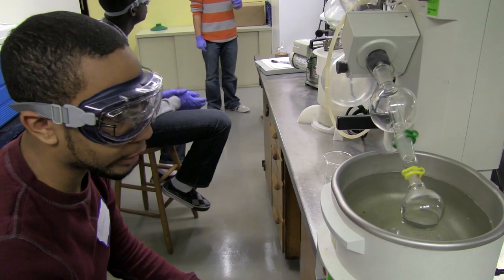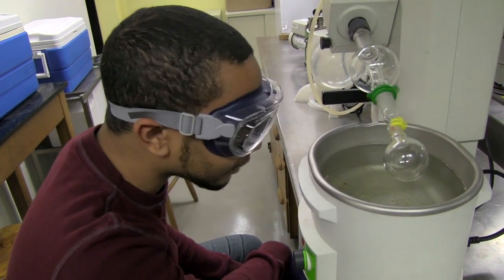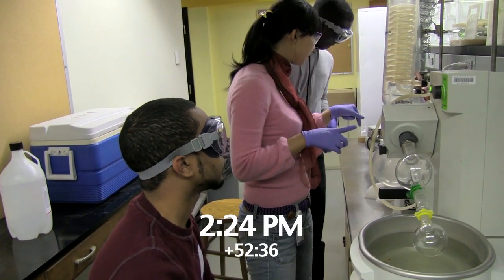I thought I did something wrong, and of course no one wants to do anything wrong, especially on the second day. You should have gotten some product. I went to Tung Fe, and I was like, I don't know you very well, but this doesn't seem like it's working.